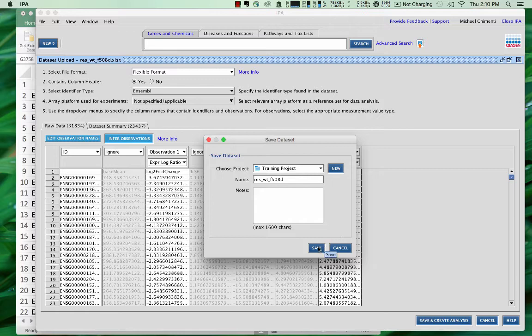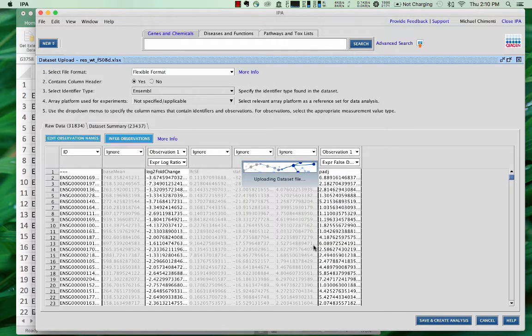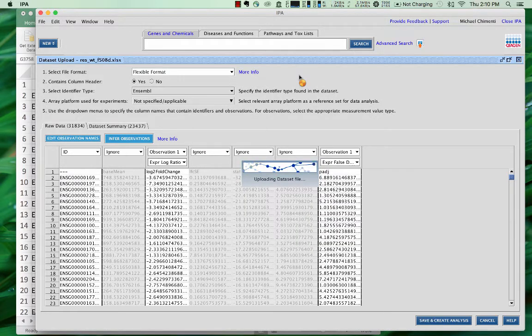You give it a name. You can put some notes in here. And now it will upload it and take you to the next screen.